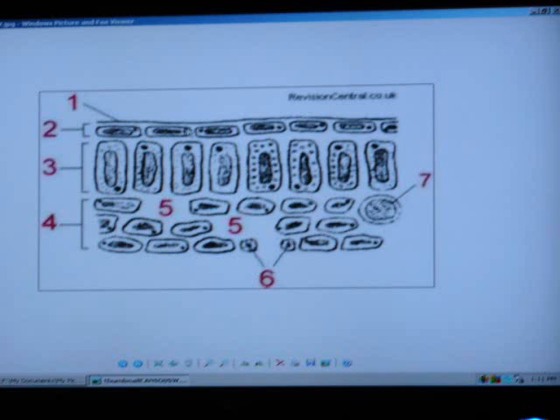Now, what would you call everything inside here? The mesophyll. And the tall ones are called what? Palisade. I would say mesophyll or parenchyma. And the kind of scattered around ones? Spongy. What do you call this in here? The airspace, the air goes in. They need the carbon dioxide, and they're going to release oxygen that we need. Plants are our buddies. Number 7, what would that be going through there? That's the vessel.